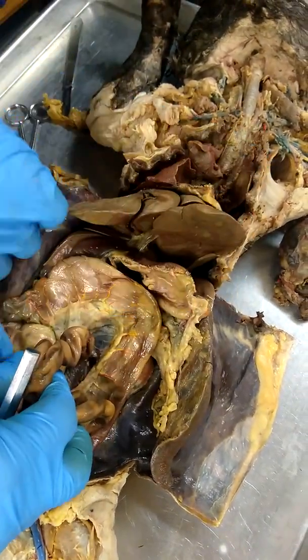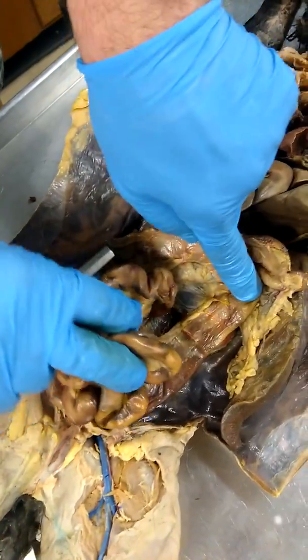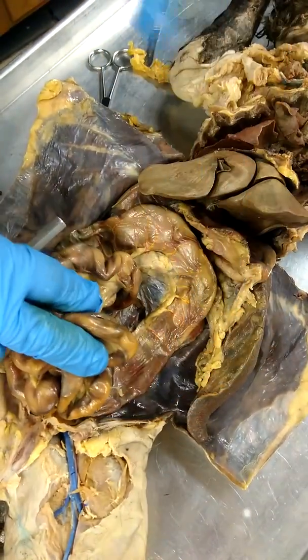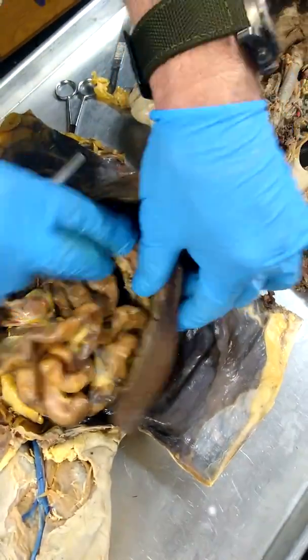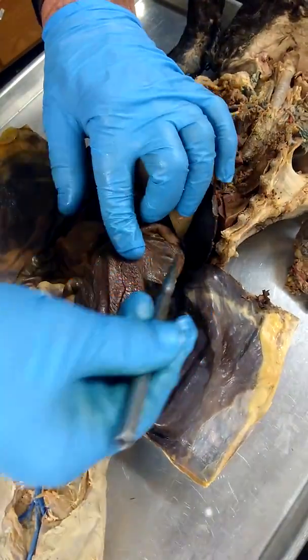And then for the regions of the colon, we have ascending that goes up, transverse that goes across, descending that goes down. There's no sigmoid in the cat. Okay, your other organs, the spleen. This big thing here is the spleen.